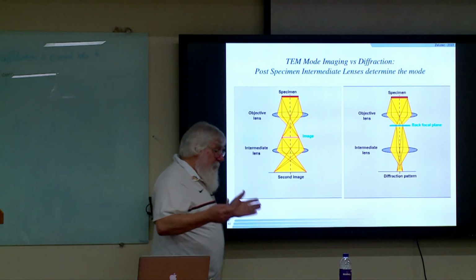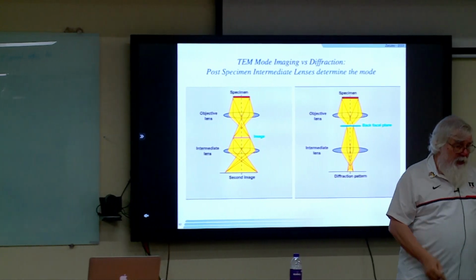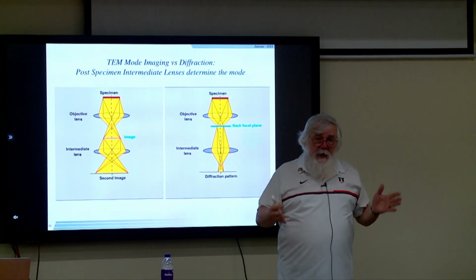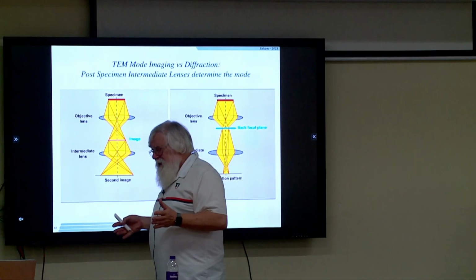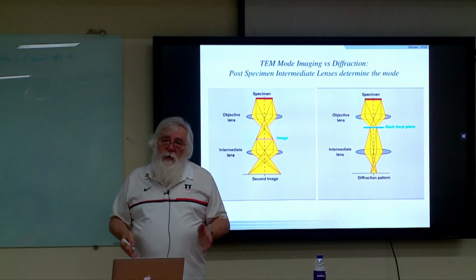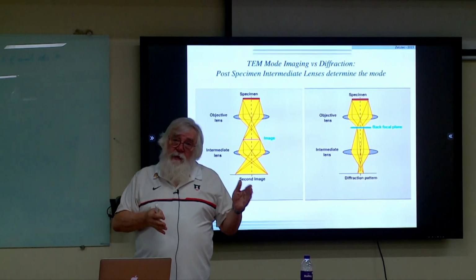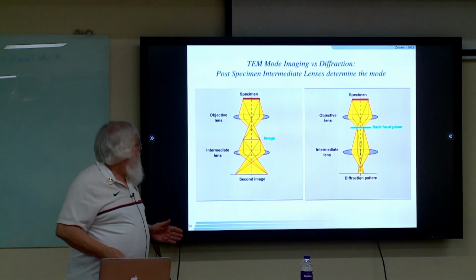Remember, I told you it's a microscope. Well, I called it an electro-optical beam line. Most people call it a microscope, and most people think of microscopes as just an imaging device. The important thing that we're going to talk about, is it this afternoon? This afternoon is diffraction work. So we want to be able to change the operating mode of our microscope between looking at an image and looking at something called a diffraction pattern. We'll talk about what diffraction is this afternoon, the basics of it.